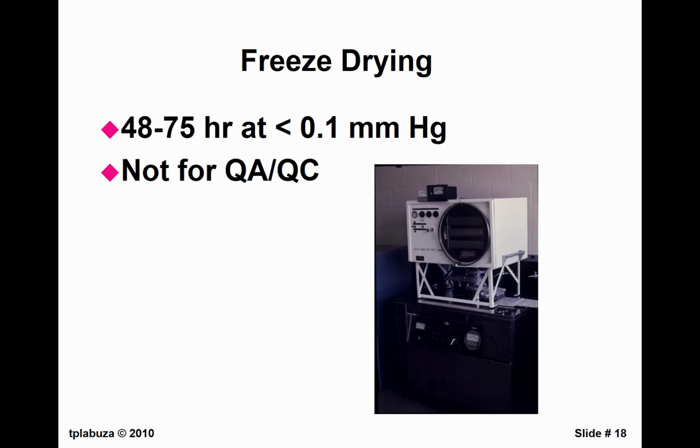There is a place where the water condenses back into ice in between there. It's in the back part of this. So the water sublimates, and then you have a high humidity there, and so the water is going to migrate to the cold surface and then freeze onto the cold surface. So very similar to what we saw with the trap, but we're doing it a different way, all internal in here.